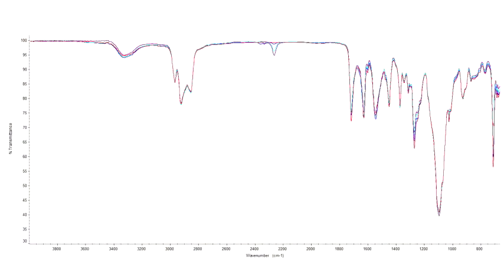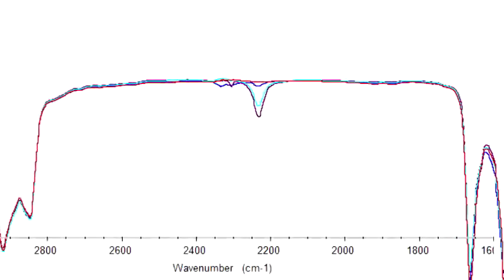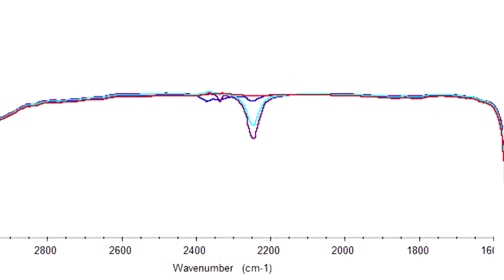Let's look at the urethane IR results. Specifically, the point of interest is the isocyanate band located at 2260 reciprocal centimeters.